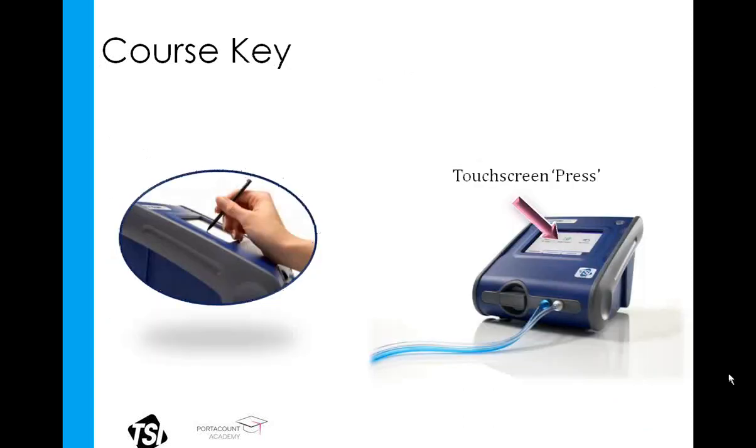Now, during the presentation, you may see this small purple arrow appear, and this represents a touch on the touch screen of the PortaCount Pro unit. The screen captures in this presentation are based off of standalone operations, but the FitPro software operations will look almost identical.